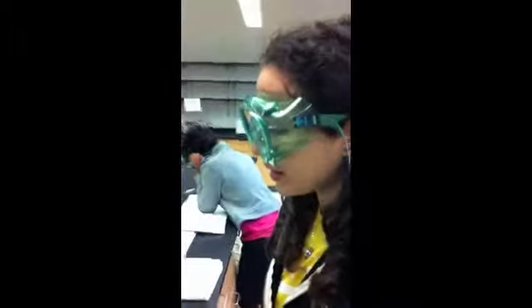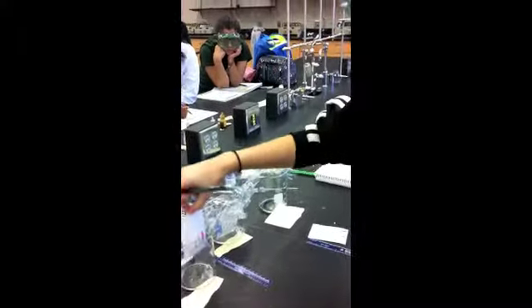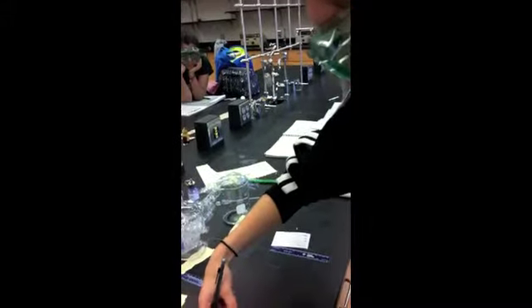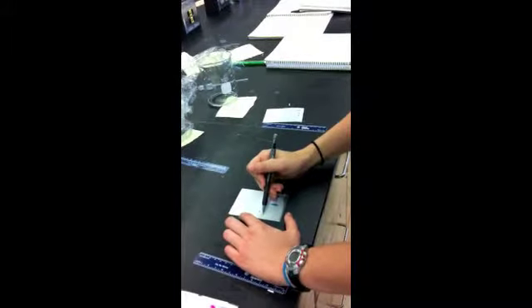After 10 to 15 minutes have elapsed and the dyes have stopped moving, we can remove the TLC plate from the solvent and set it down. Now we mark our solvent line so that we can see it, take our retention point, and then circle our dyes.